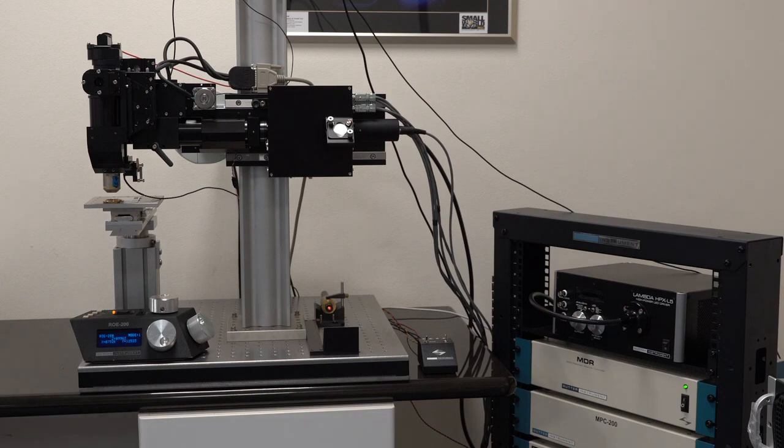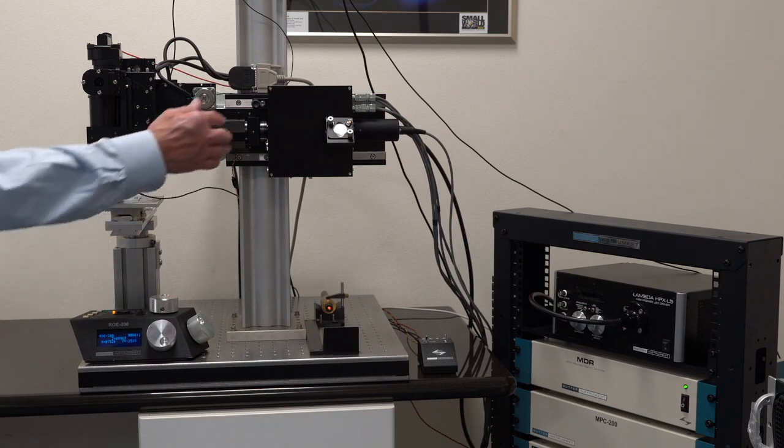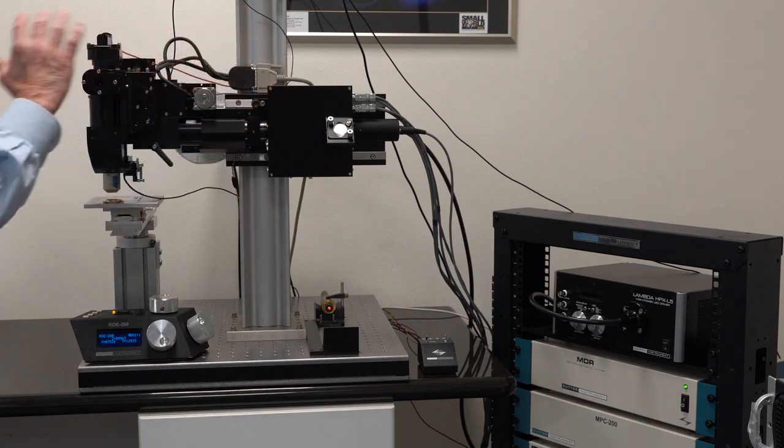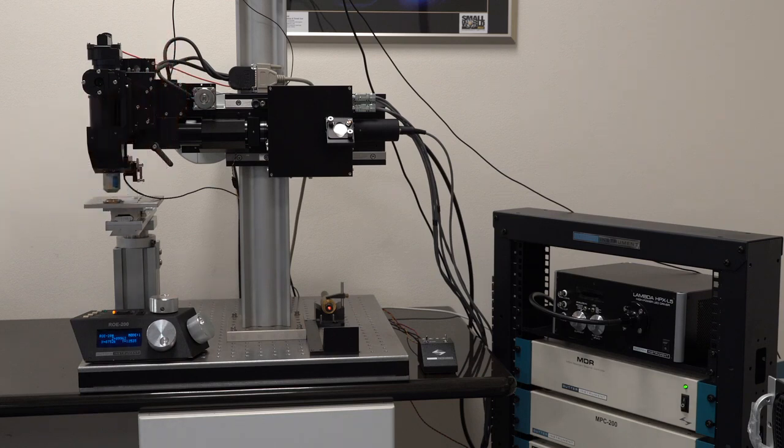First, just for clarification, the central core of the MOM, which consists of the large slide and the XYZ movement of the objective, is identical to the original Winifred Dank design from more than 15 years ago. What that means is that new features we add today, be it scanning hardware, detector paths, or three-photon capability, can all be retrofit into the very first MOMs we sold. In addition, you do not need to worry that a MOM purchased today will become obsolete as newer technology becomes available. We've always strived to make modifications that can be added to existing scopes in the field.